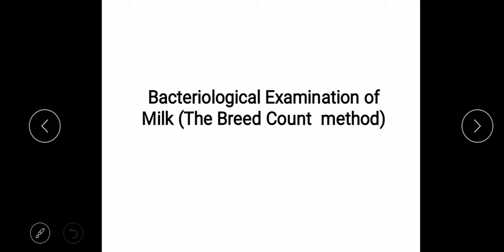But before the field counts can be translated into organisms per milliliter, it is necessary to calculate the field area. High quality milk will have very few organisms per field, necessitating the examination of many fields. A slide made of poor quality milk, on the other hand, will reveal large numbers of bacteria per field, thus requiring the examination of few fields.